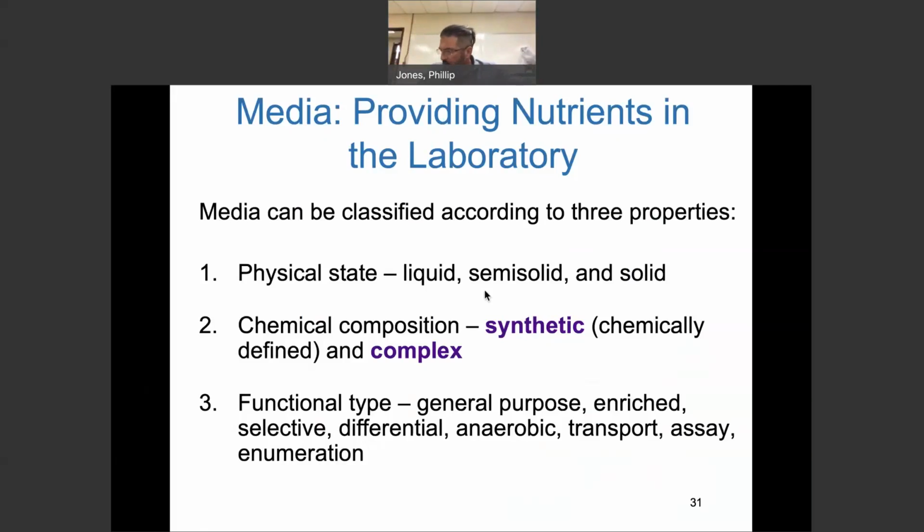And then here is liquid. This is nutrient broth. This is a nutrient slant, so this is nutrient agar. And rotate that, but it's kind of at a slant. So when you grow this, it has a surface to grow on. So it's going to be at an angle.